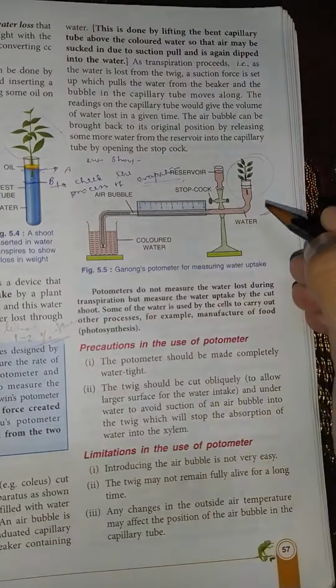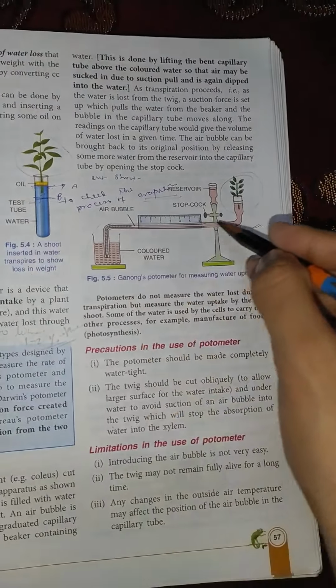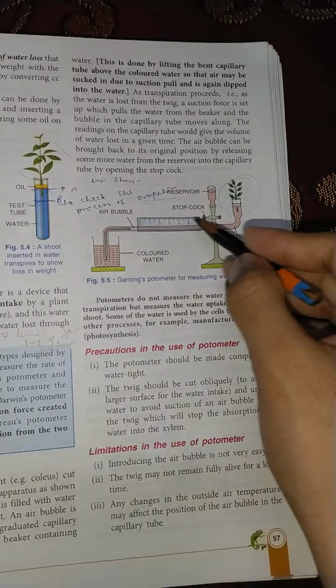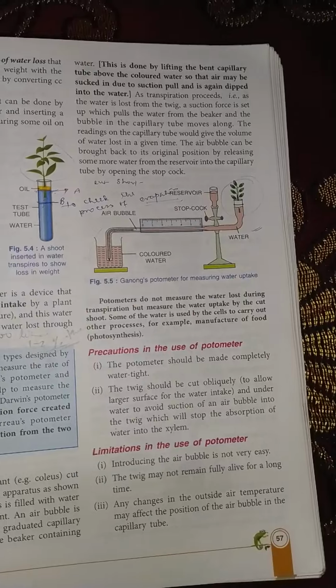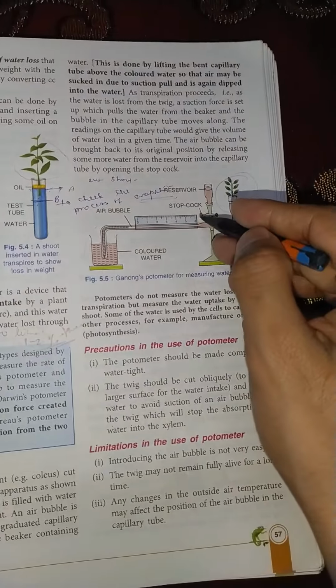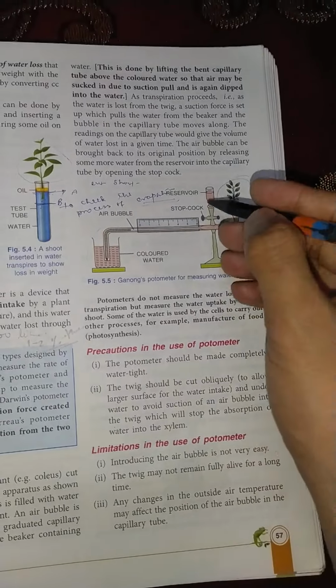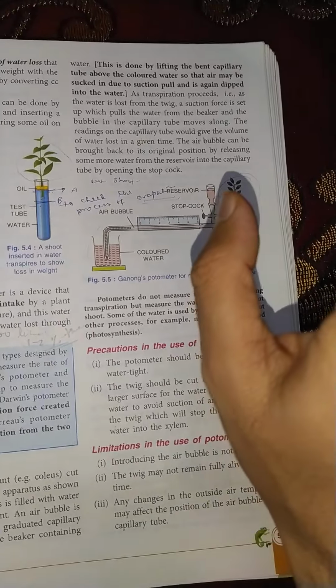This long tube is called the capillary tube, in which we have a scale to measure the rate of water intake by a plant shoot. Here we have taken a reservoir with a stopcock. A reservoir means the place where the water will be stored. I will tell you the function of the reservoir later.